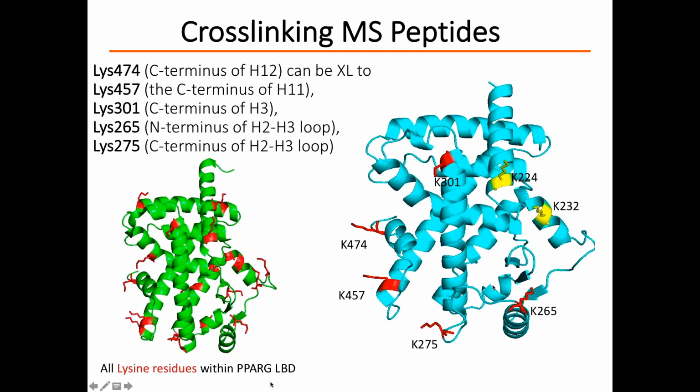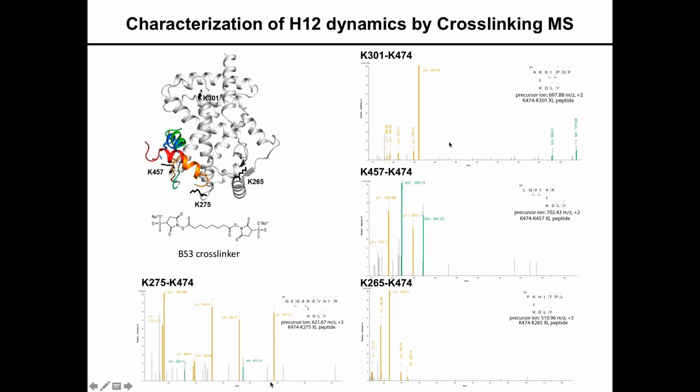So we want to manipulate the dynamics of this helix 12 in solution, and look at the protein-ligand interaction, how the compound can affect the dynamics of helix 12. And we use pLink 2 to finally identify all the possible cross-link reactions.